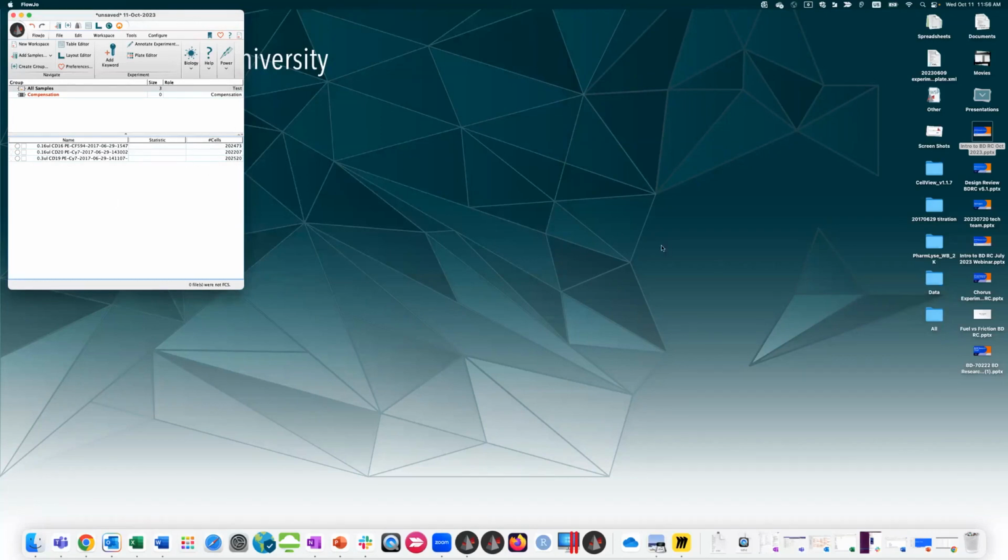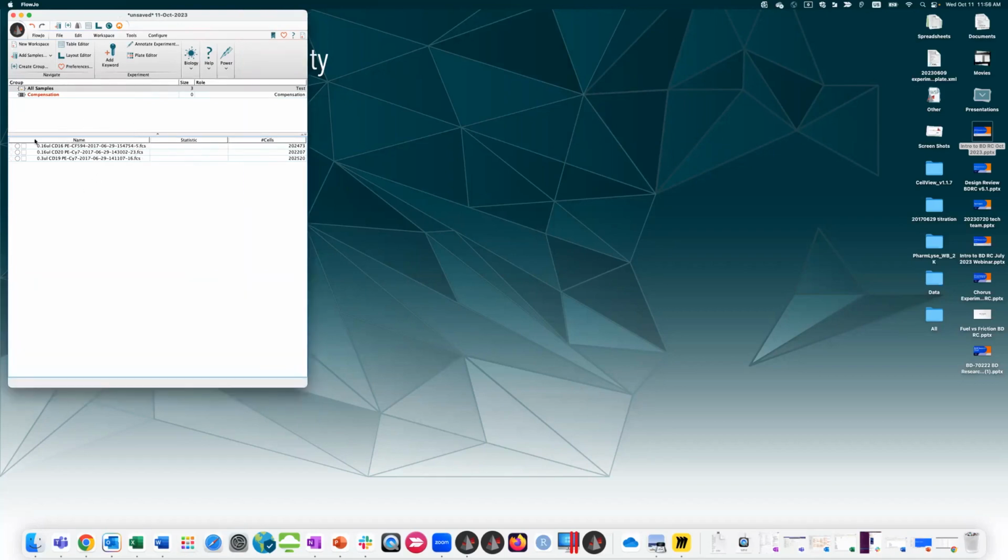It'll download those files in the background so that the files are actually local. So right now, FlowJo is not connecting to BDRC and performing analysis through a server. It is performing analysis through files that are local. And in case you're not aware, FlowJo really does have optimal performance when the files are locally stored.